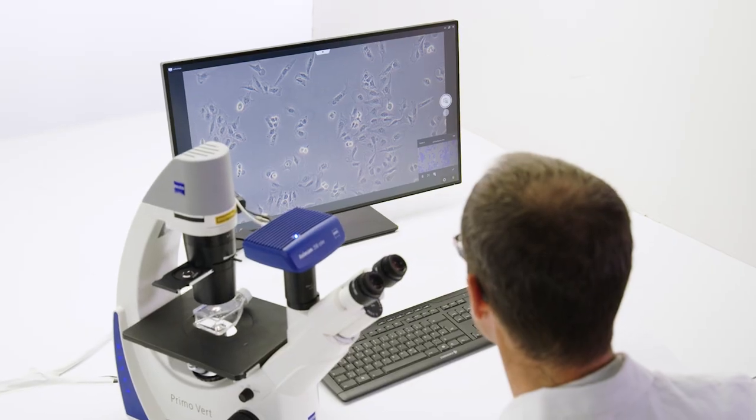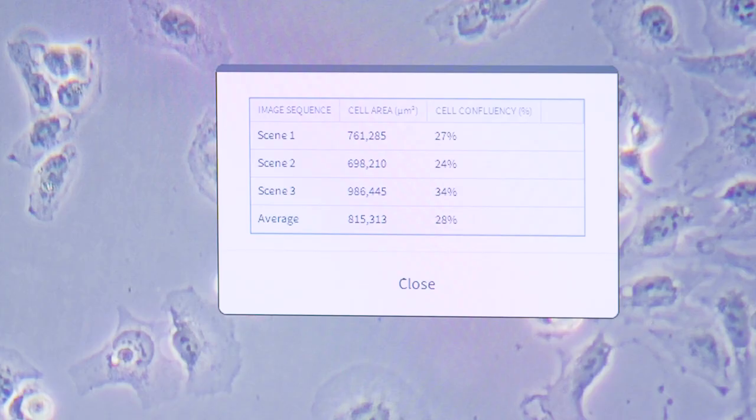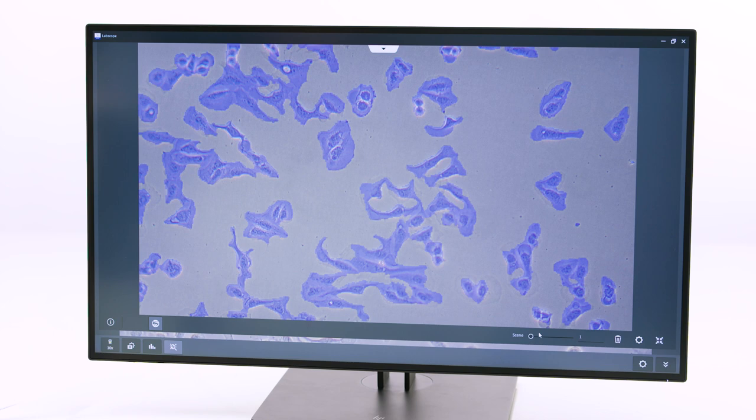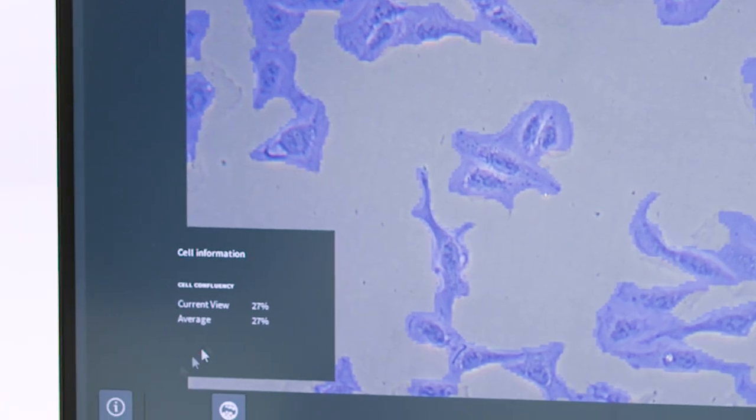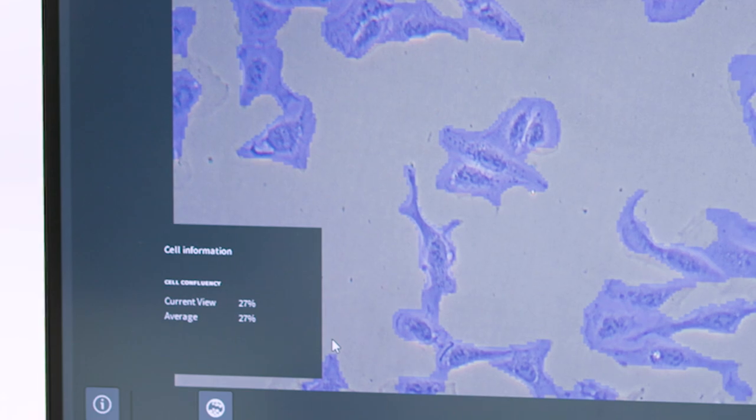The software will also calculate the average confluency from all acquired images. LabScope AI cell confluency is really fast and easy to use. Plus, you get meaningful and reproducible results that can raise the quality of your cell culture.